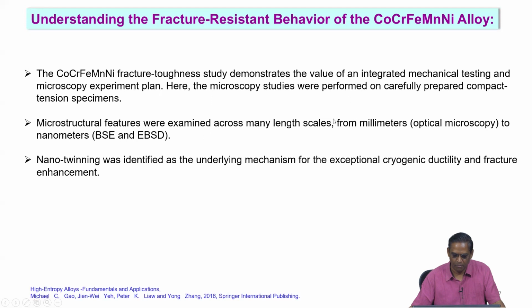Again, we have combined all these techniques, BSE and EBSD here, to identify this orientation, especially wherever a deformation related study is required. It is wiser to use EBSD, because it gives the orientation. You can identify the kind of slip direction, twin plane. We will be able to correlate with that.